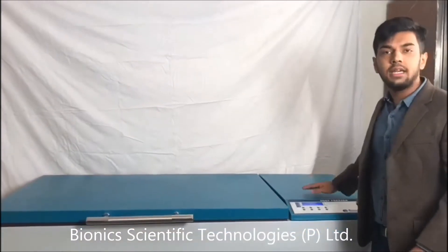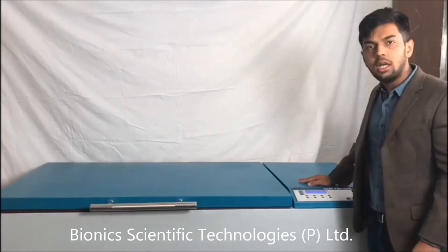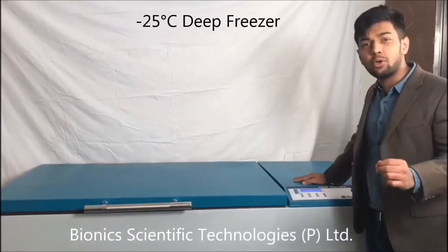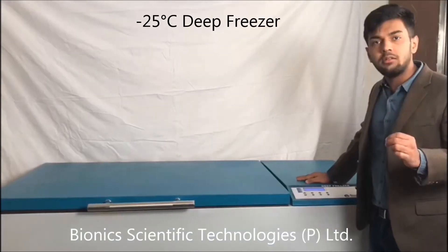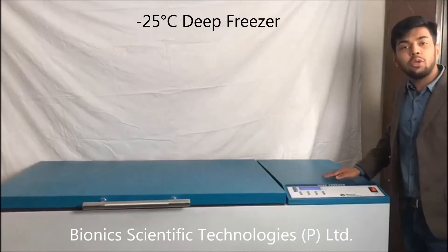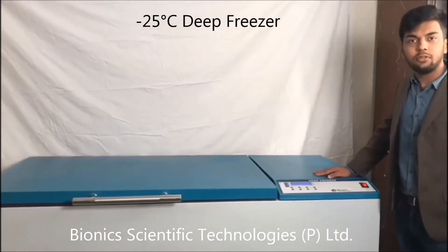Welcome to Bionics Scientific Technologies Private Limited. Today we are going to show you one of our best products we have ever made — this minus 25 degree Celsius deep freezer.